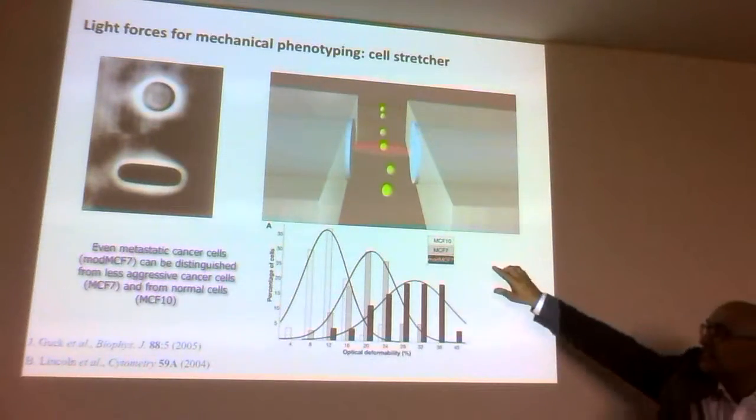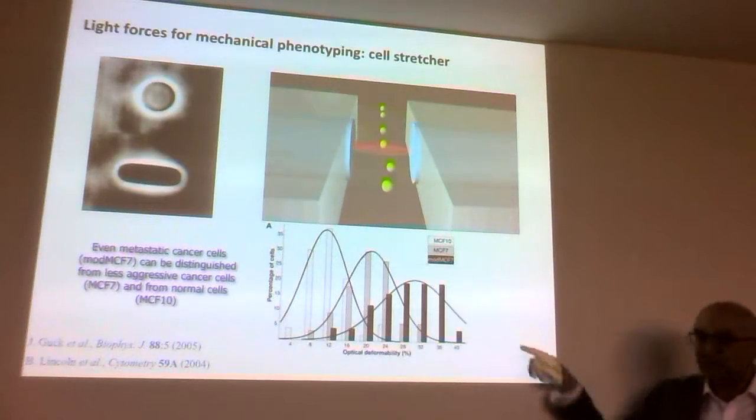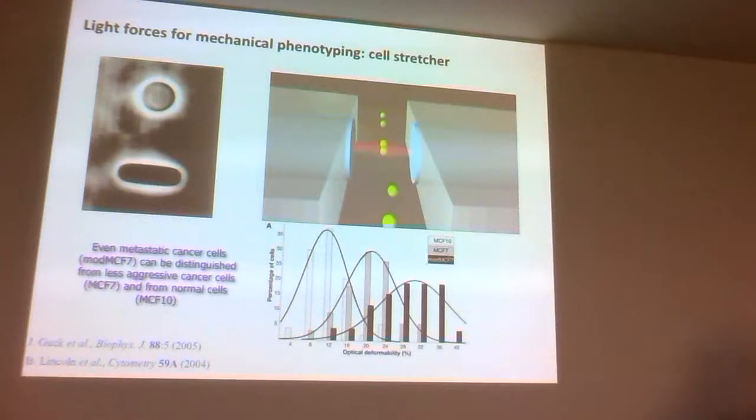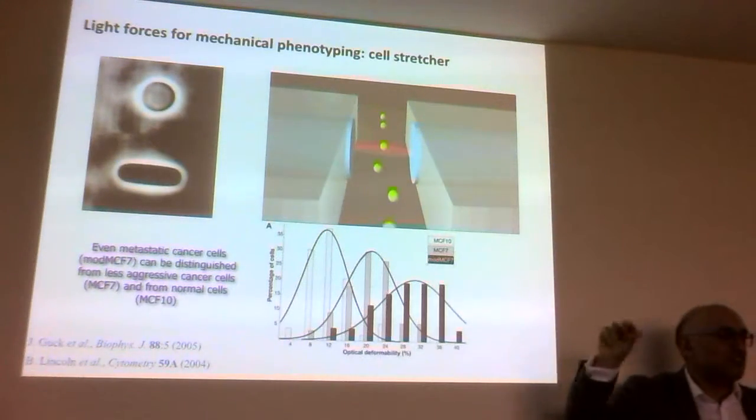And these are breast cancer cells, including one with an oncogene added. What they do is they look at a distribution. The idea is to see, basically, when cells metastasize, a lot changes, and they actually migrate to different parts of the body. They were looking at the mechanical changes in the cell. This is not the only study you can do. People have actually proved that we have optical fibers in the eye. I could talk about that for 10 minutes if you wanted. Beautiful paper, again by a group at Cambridge. Amazing, it was a front page of PNAS about 5-6 years ago. But this is an example of the distribution of cells, and you can see here, basically cancerous cells are more squashy.